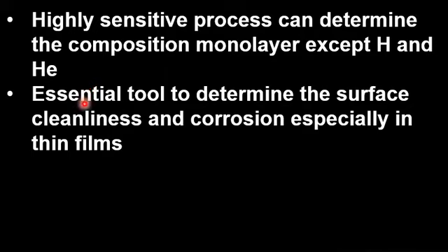Please note another interesting fact: with Auger electron spectroscopy you can determine the surface cleanliness, and also corrosion if it is present in thin films. Usually when you prepare a thin film by different vacuum based techniques or chemical solution based techniques, there is a possibility of different types of impurities which may be created in different ways.